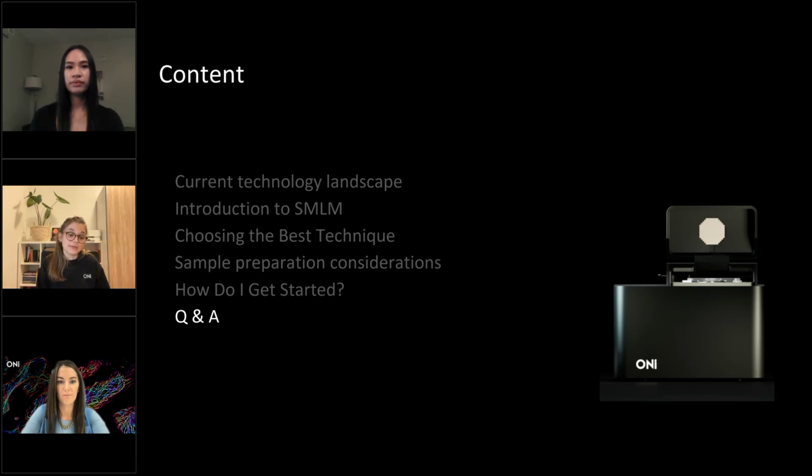So normally with permeabilization, we always recommend as a general rule to have the condition with permeabilization and without permeabilization, so you make sure that what you finally image is actually not just a random background, but it's really specific to your sample of interest. So in that way, having good controls can give you more confidence that the permeabilization worked and that it is not hindering your imaging. But in general, it's okay to use, especially for interior cell targets.